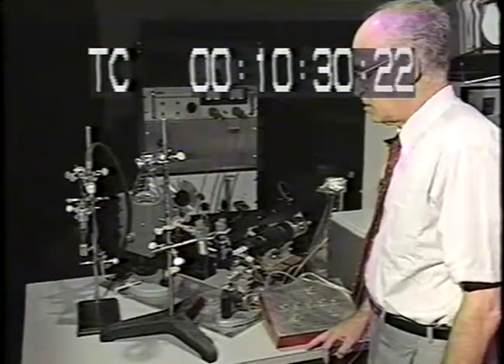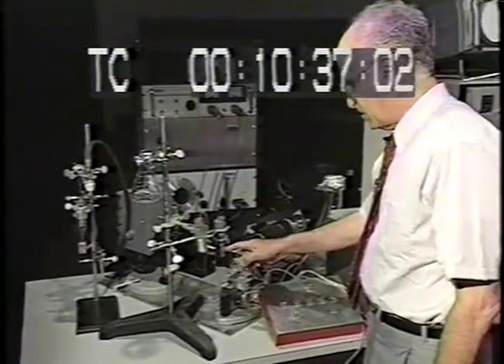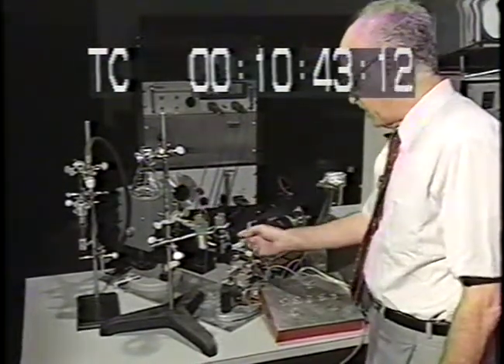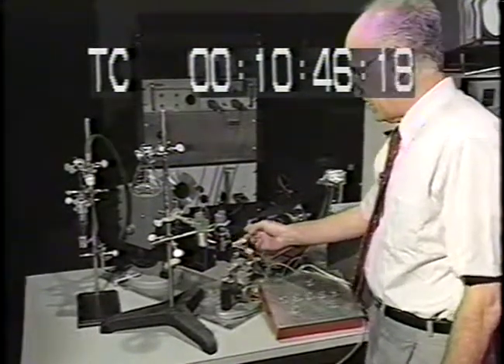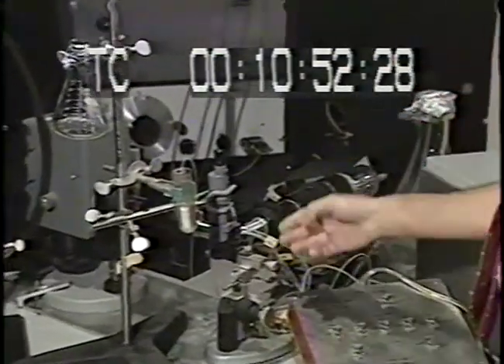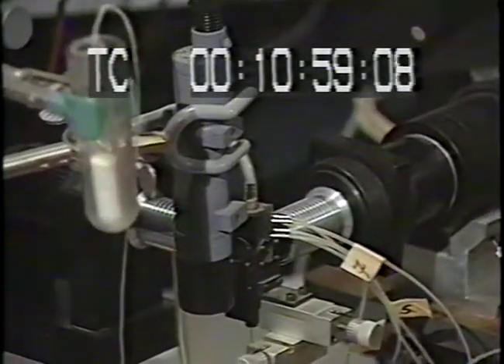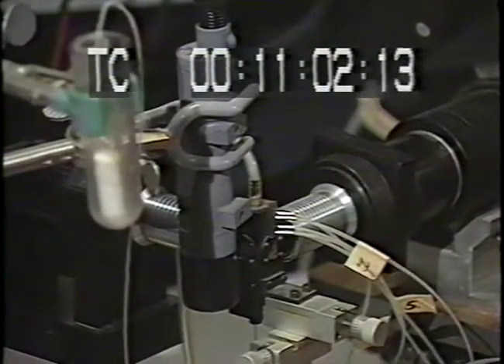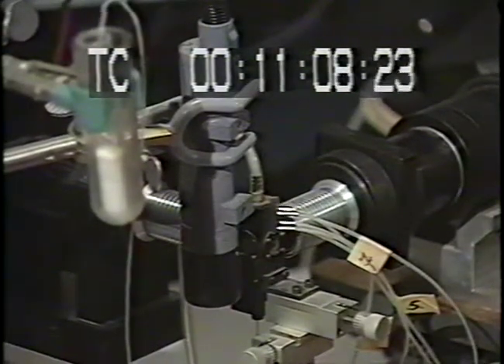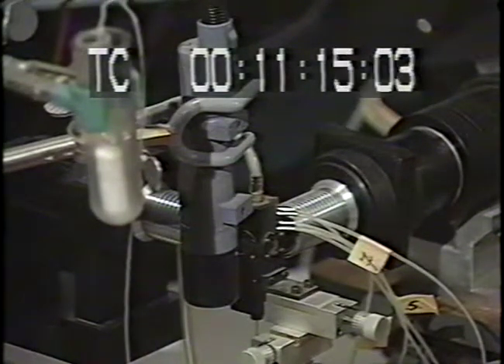Right. And that's the principle of the cell sorter, where before one can send signals to the oscillator, one has to detect the cells. And the detector is what is most important. Even today, I would say most people who have a cell sorter use it mostly for analytical applications rather than separating cells. And so my instrument was used only for analytical.